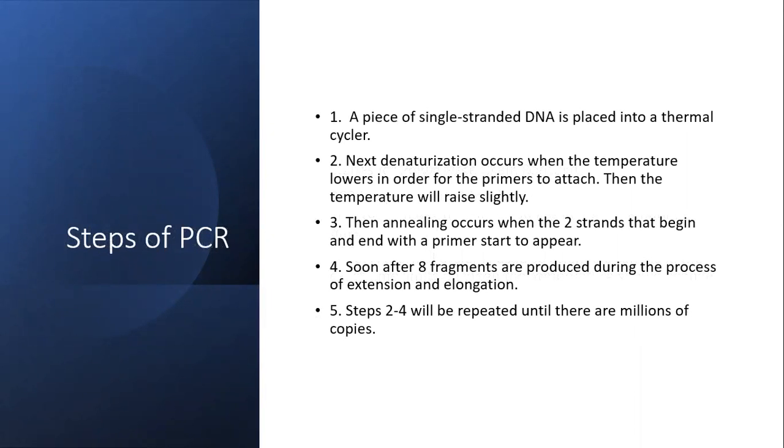Now, the steps of PCR. So first, a piece of single-stranded DNA is placed into a thermocycler. Next, denaturization occurs when the temperature lowers. This is in order for the primers to attach. Then the temperature will raise slightly.